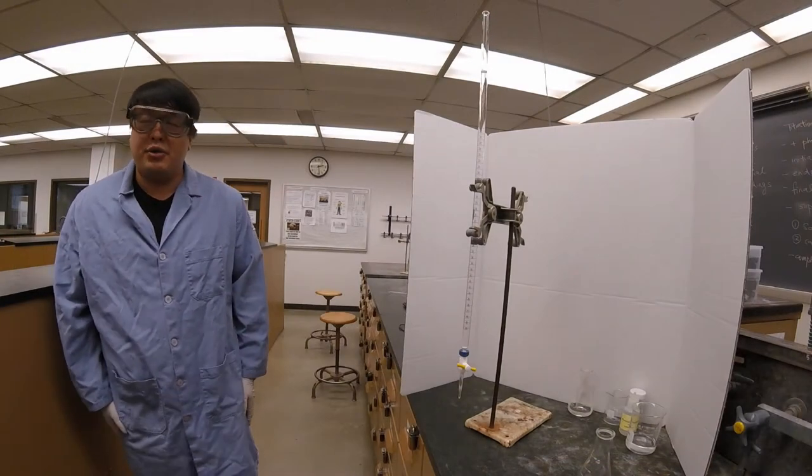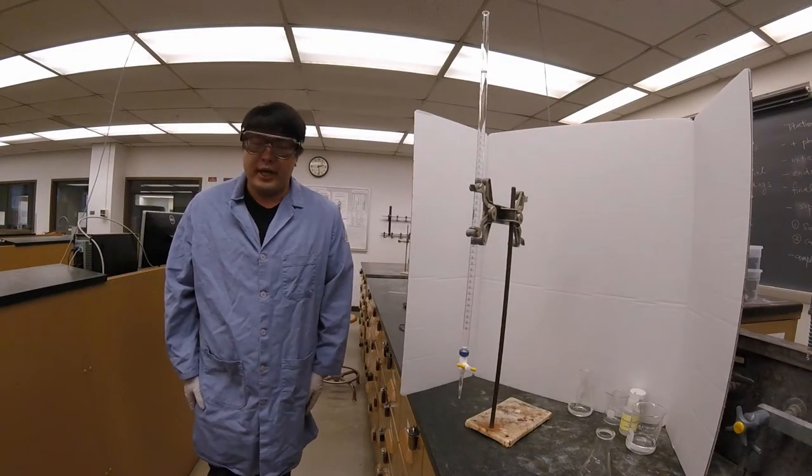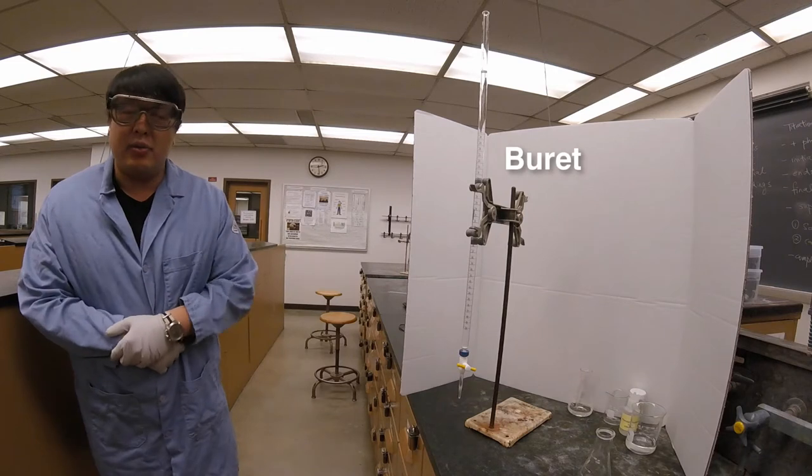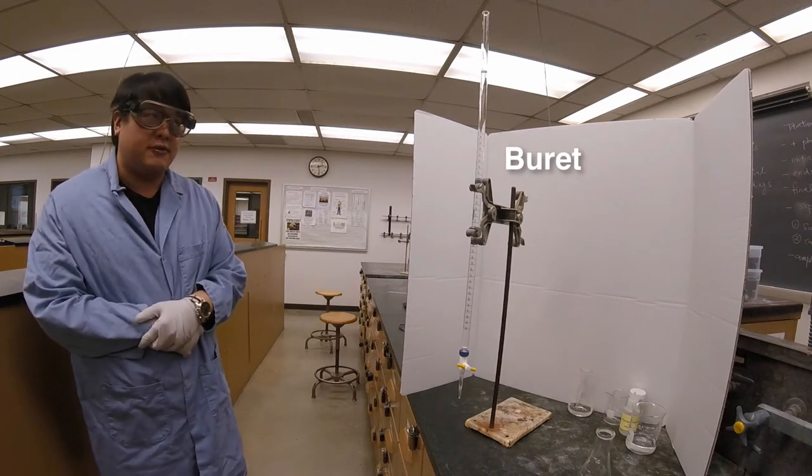In this video, we're going to show you how to read the volumetric buret. As you can see, we've already loaded it with NaOH and we've already checked for air bubbles.